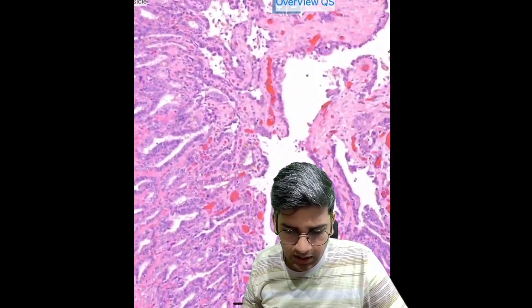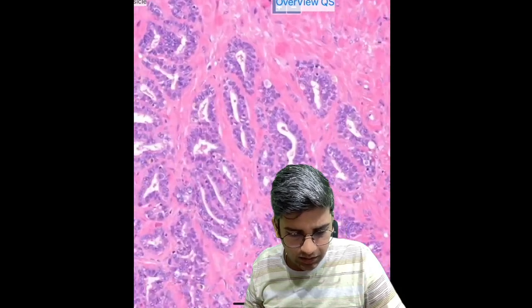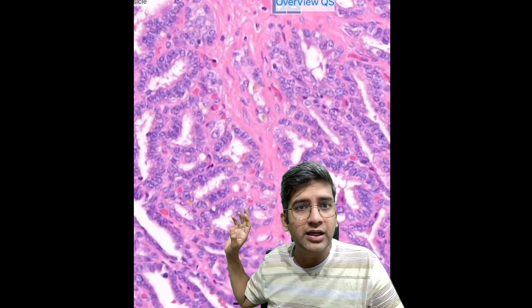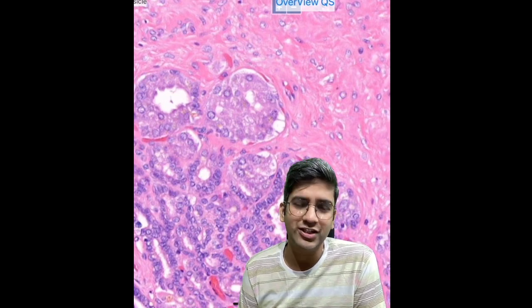Fine. Let's go into a cut section of a gland. Look at this. It's very complex tubular, right? Again, the lipofuscin pigments. Again, it's stratified. Sometimes it looks like a single layer, sometimes it looks stratified. It's completely normal. And if you come across ugly looking cells which are very big and have a clear or vesicular nucleus, don't worry about it. It's a normal variation that we see in seminal vesicle, right?